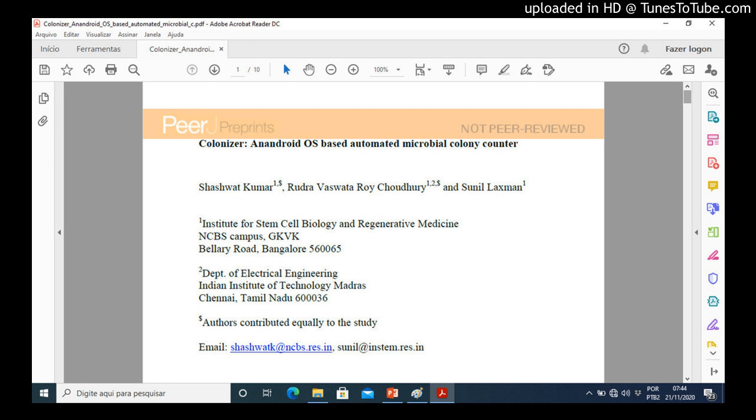Cardboard box setup for correct lighting. A small cardboard box, illustrated in figure 2, with a movable lid and small hole was used to ensure uniform illumination. One face of the box is kept open to ambient light, which acts as the light source for imaging. The petri dish sits at the bottom of the box on a black sheet.